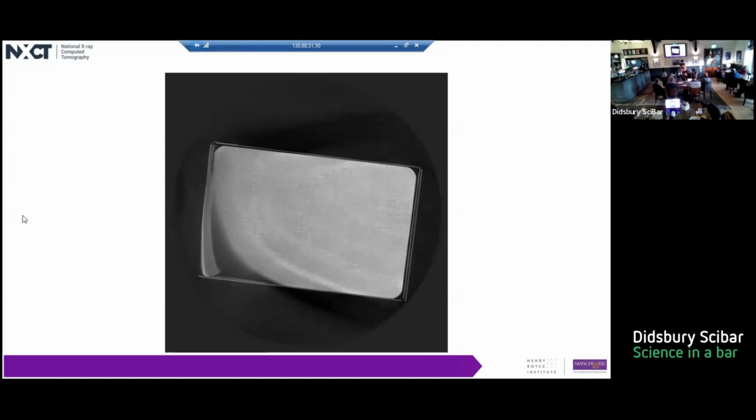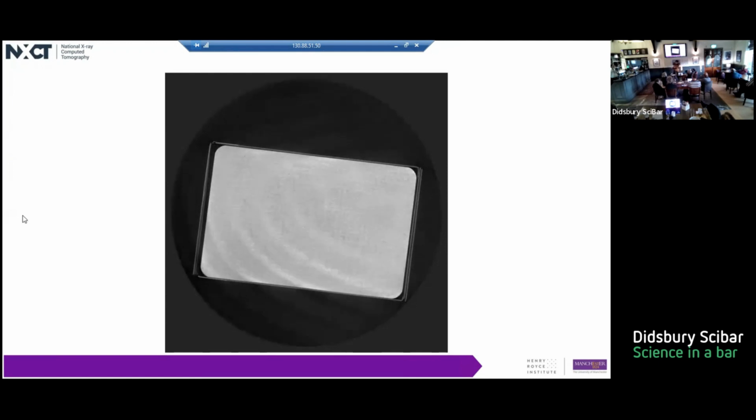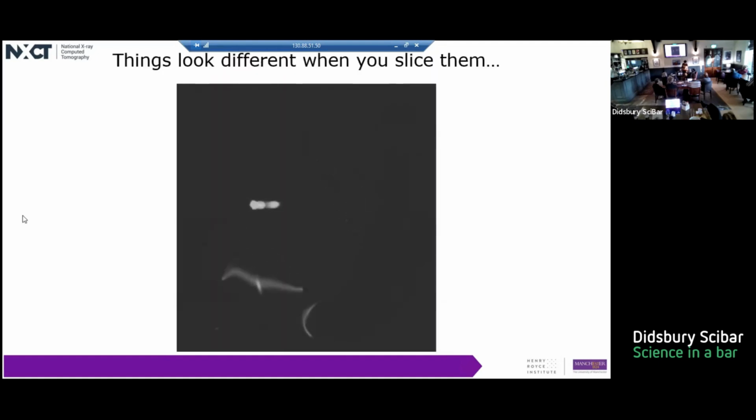So we started out with our deck of cards, we deconstructed it into individual layers, and then we came out the other side with a reconstructed deck of cards in the computer, ready to do what we'd like with it. And the question is, well, why would I want to have a digital deck of cards? I don't know, maybe, might be interesting. But really, usually we're scanning something far more interesting than decks of cards.